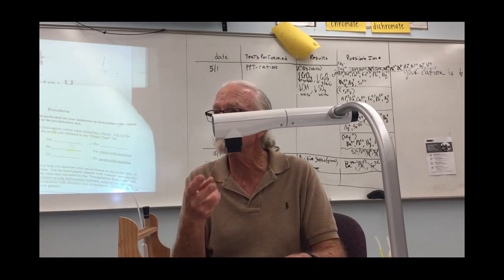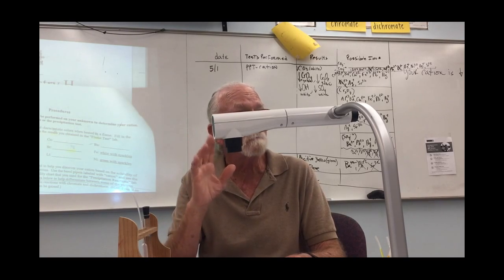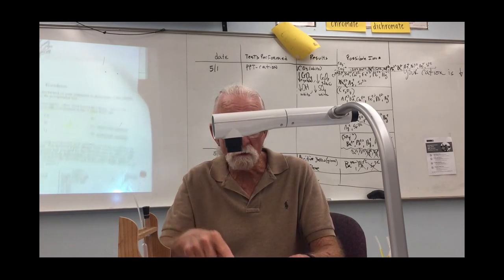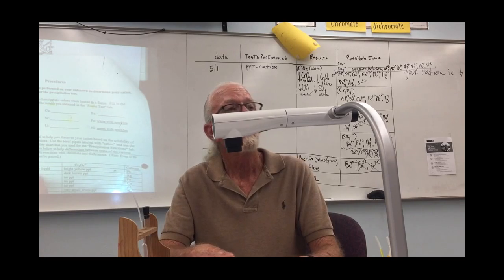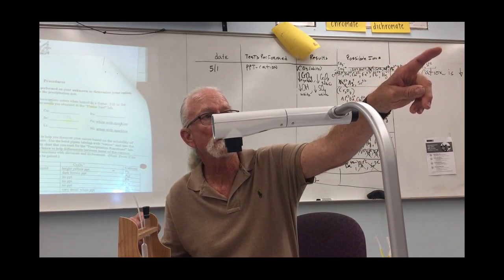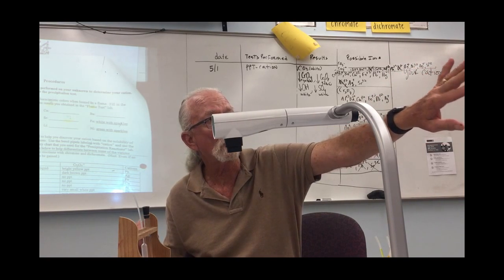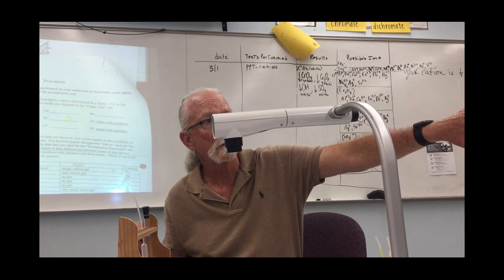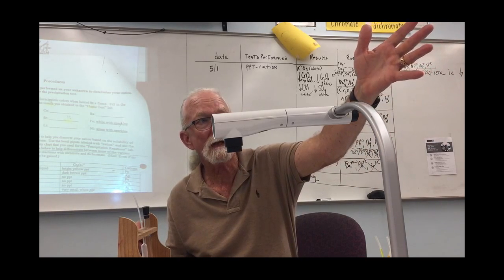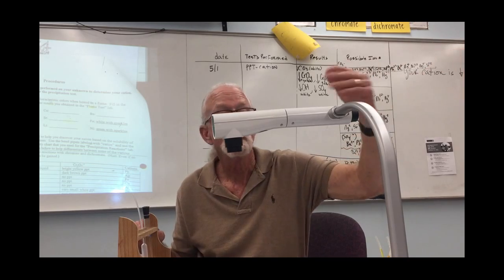Well, if there's only 2 positions to do the flame test, and you look back and there are 2 people there, chances are you need to start here. All the cation section is in pink in the very far corner. All the anion section is in purple on the left side. So all the tests for cation are going to be back in that corner. Okay?